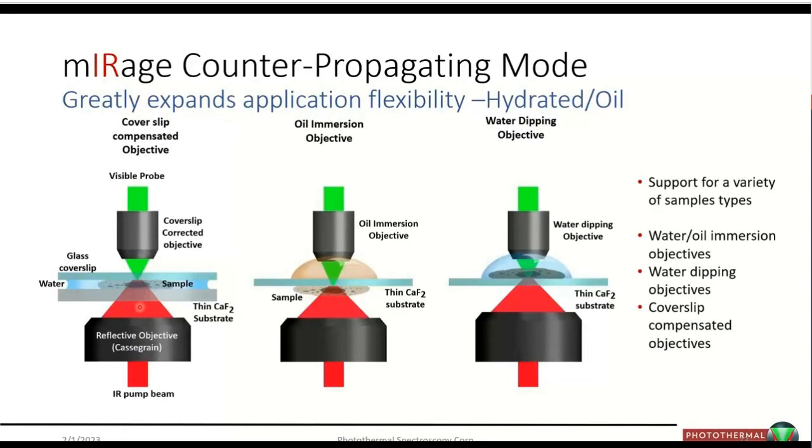Anyone coming from an FTIR background will know that typically we believe, or we're told, that infrared and water are completely incompatible. And that is true, except that when your infrared doesn't have to pass through water, then it's really not an issue, and that's certainly what we have here. You can also imagine the same thing on a glass cover slip without water. You could have perhaps a thin polymer film sitting underneath your glass cover slip, and you would reap the same benefits.